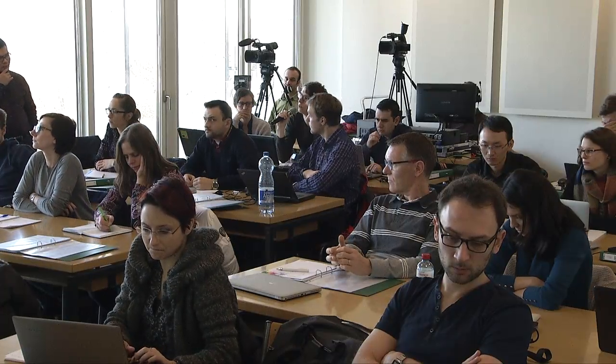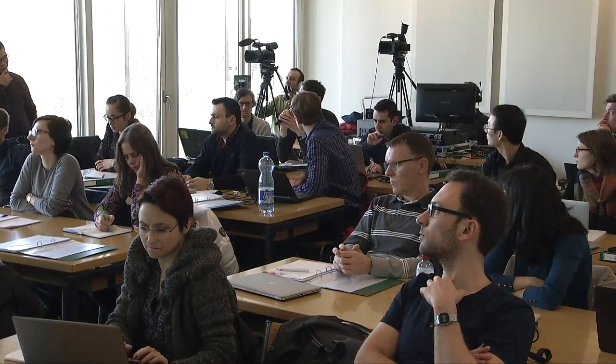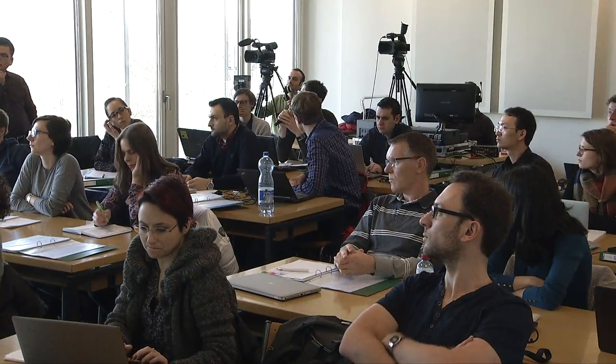Okay. So let's say in a 2-day SWATH analysis on human samples, how many MS2 peaks get assigned today? From the SWATH, in our best data, this is again something Yansheng will cover, right? But I think in our best data with our standard setup, which is a 2-hour gradient, we can detect around 50,000 peptides, maybe 40 to 50,000, which corresponds to somewhere in the range of 4,000 to 5,000 proteins.